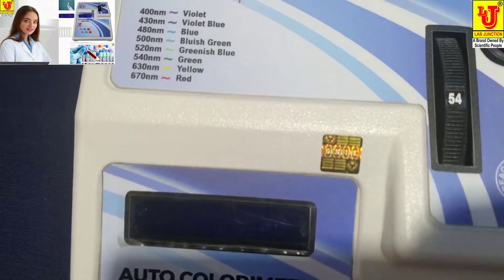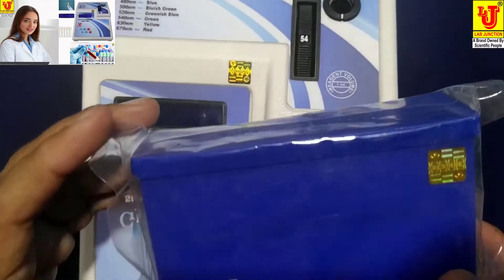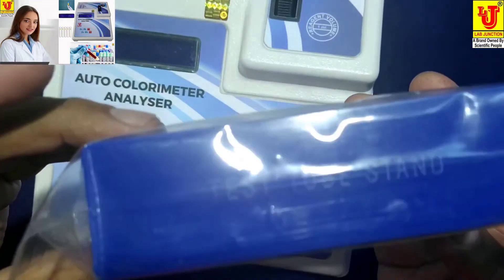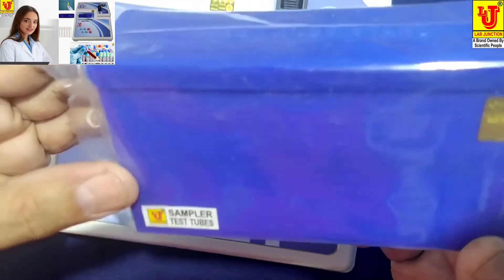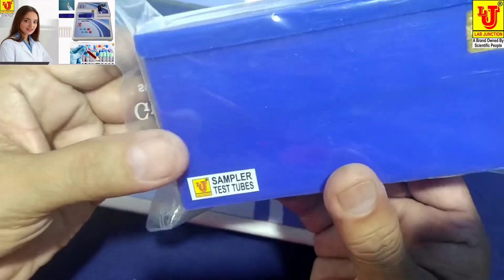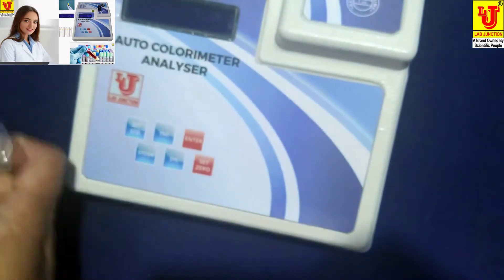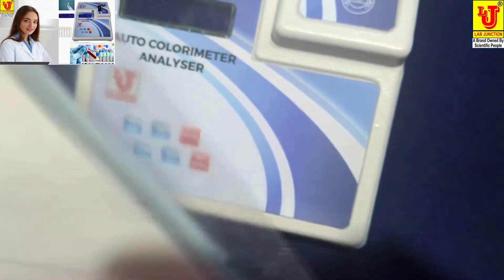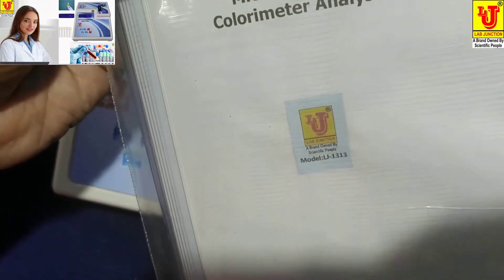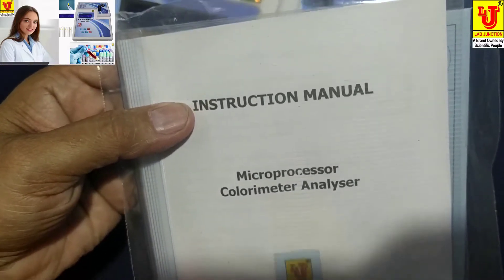With this colorimeter, we supply test tubes — a set of five numbers with stand — along with an instruction manual, one-year warranty card, and dust cover.